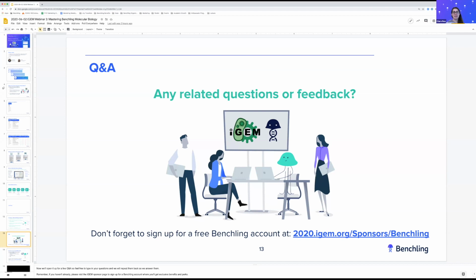Yeah, absolutely. Okay, awesome. One person asked, does Benchling have a support team to contact for troubleshooting experiments and design? Do you want to take that, Sierra? Yeah, absolutely. We have our support team on call. So whenever you submit a ticket, if you click that chat option, we're on call to answer Benchling specific questions. We're not trained to exactly answer experiment specific or design specific questions that you might have, but we can try our best to help.